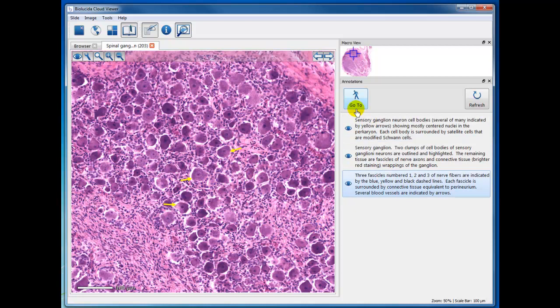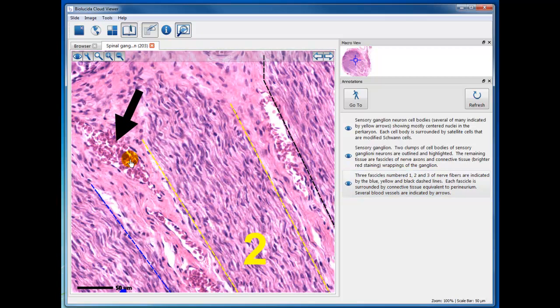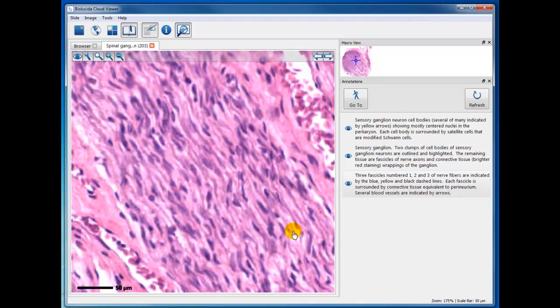And then I'm going to click on the last annotation, which is highlighting 3 nerve fascicles and a couple blood vessels. You'll soon learn in the next module that these would be venules, very thin-walled, and actually this is probably a monocyte in here with erythrocytes. But all these cells in here are Schwann cells, and the structures between, if I enlarge that a little bit, would be like these little thin strands here.